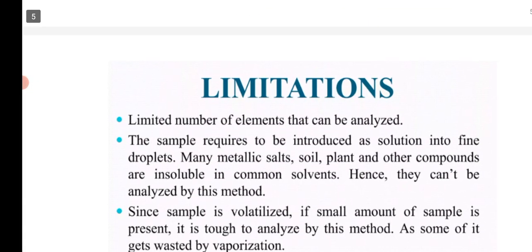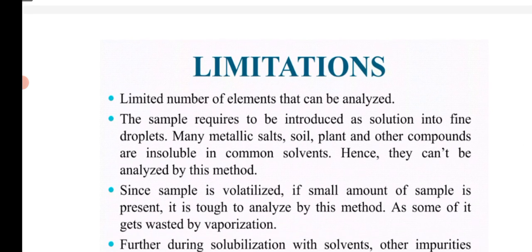There are also certain limitations, namely that only a limited number of elements can be analyzed. So here is one drawback: a limited number of elements can be analyzed. The sample must be introduced as a solution in fine droplets.